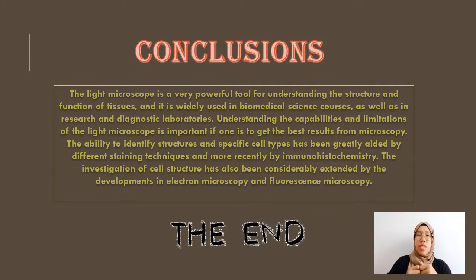The conclusion in my project is that light microscopy is a very powerful tool for understanding the structure and function of tissue, and it is widely used in biomedical science courses as well as in research and diagnostic laboratories.